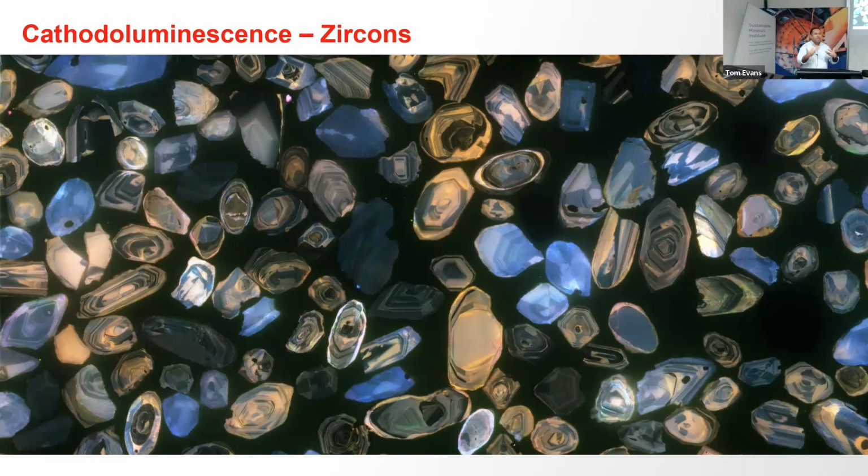And there is almost a renaissance of CL that everybody loves, especially because of this example of zircons. It shows these beautiful images with zonations, where it gives you confidence on where you can acquire, for example, spots for laser ablation or isotope analysis, to know exactly where to acquire and get the most accurate and most statistically valuable results. So this is what I have to show you today.